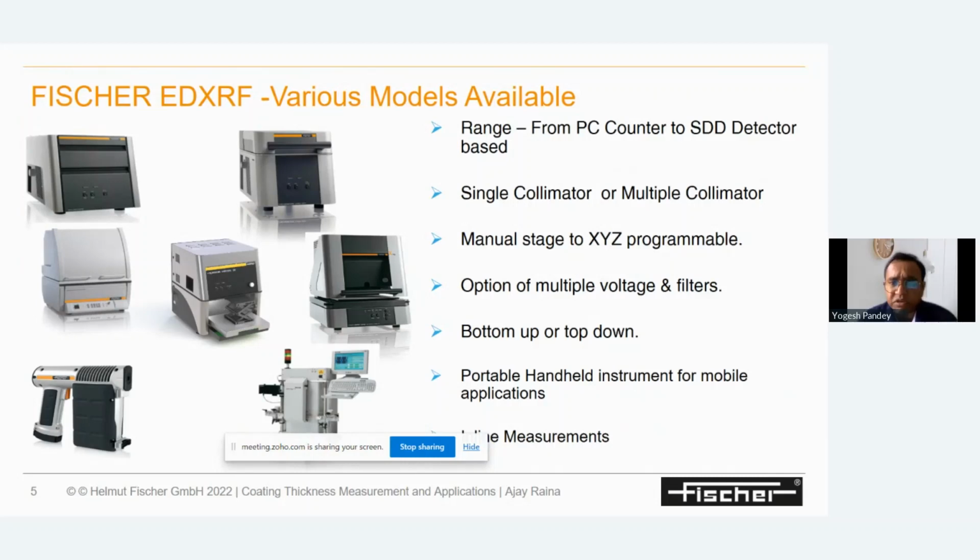First thing, whether it is a PC counter, SDD detector, or silicon PIN, based on the detector it is bifurcated. Based on collimators, it is bifurcated. And based on the automation, some models that we have are manual, and some have programmable automation.